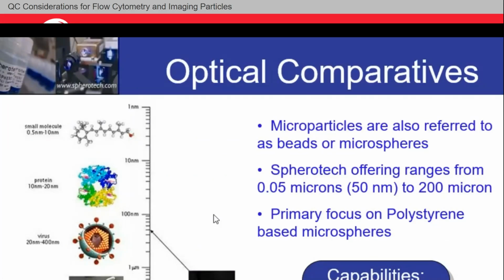So again, why would we use particles? Why are particles important? Why might you care? It's because they can be used as rulers. They give us insight into this very specific biological range between maybe 100 nanometers, just thereunder, and 100 microns. Most cells, biological life, potentially viruses or bacteria, all kinds of fun things. We can antibody coat them. We can use them for all kinds of testing.